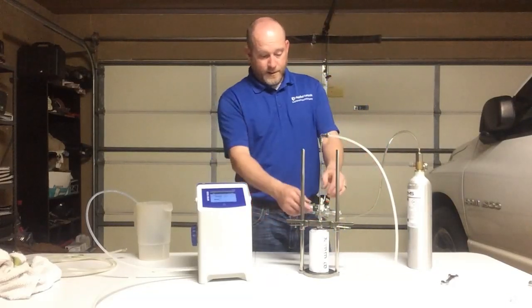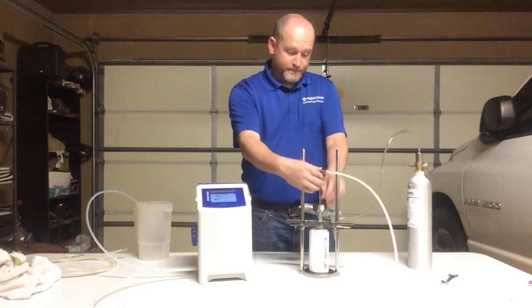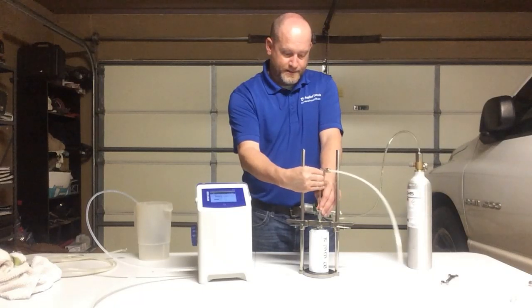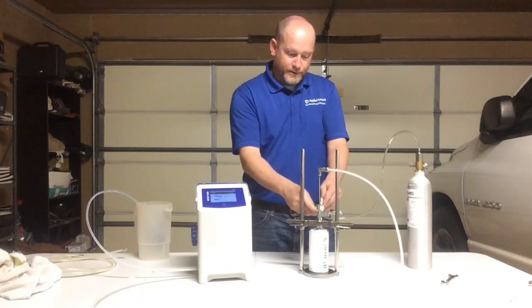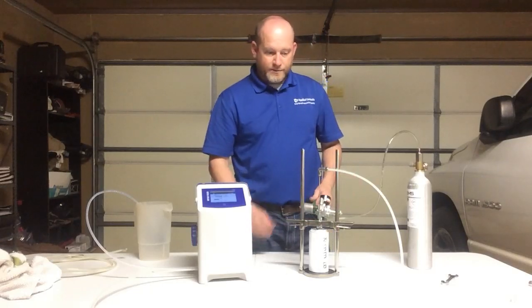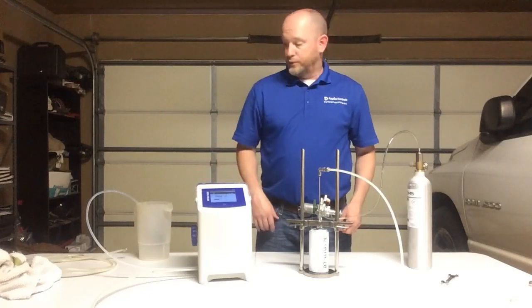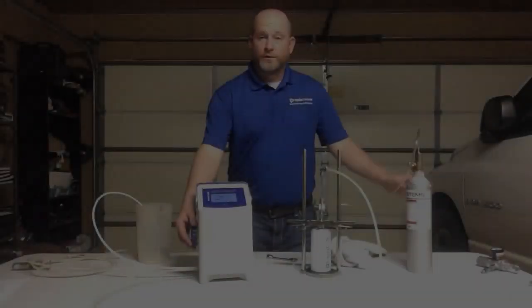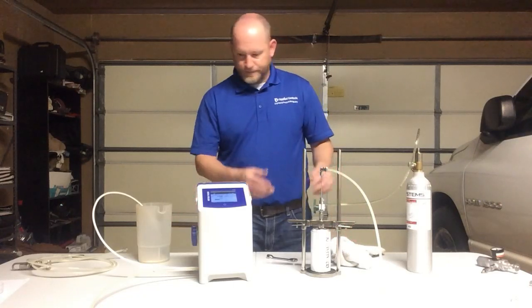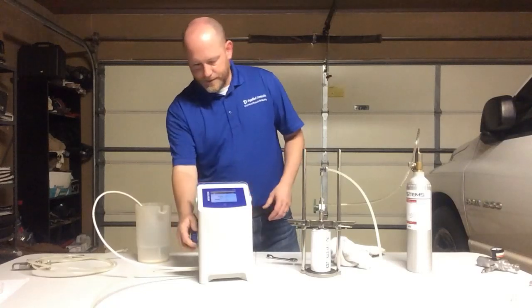Now that we have it, we're going to push this all the way down to the bottom, and then bring it off just a little bit from the bottom of that can. And now we're going to turn our nitrogen on. So we've got our nitrogen purge going, and it's going to start sending beer through the tubing and through our portable DO meter. So I've got beer running through this now, and with my first beer, we can see I've got product coming out here into my drain, my makeshift drain.